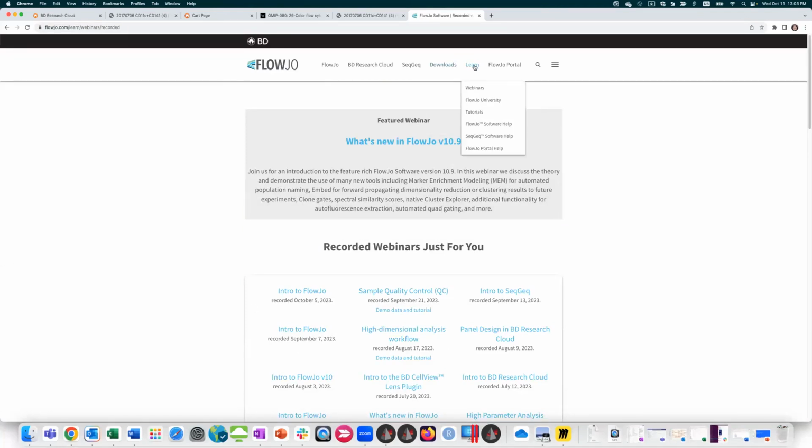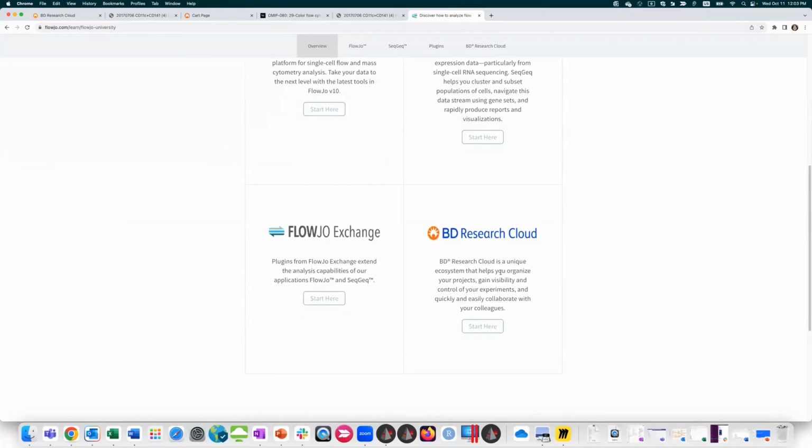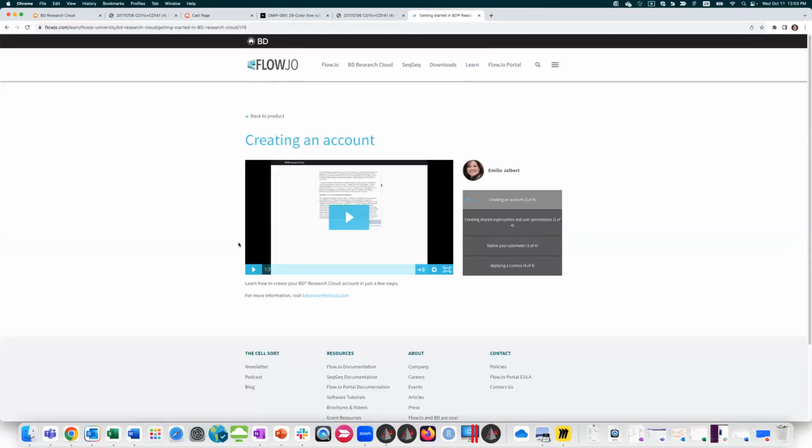Other resources available to you is FlowJo University. If you click Learn, FlowJo University, then you have our different products. If you click on BD Research Cloud, then you have access to short bite-sized videos, just one or two minutes long, of different sections of BDRC. If you just want to quickly be reminded on how to perform certain tasks, that's available there as well.